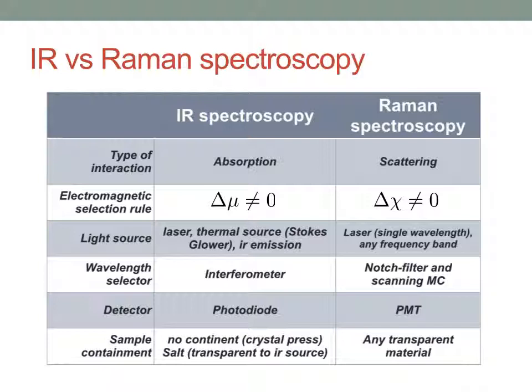And instead of using an interferometer, if I'm not using a laser source, I would have a monochromator, but if I'm using a laser source, I wouldn't. But I need to have some sort of excident monochromator regardless, so I can select the wavelength of the excident light regardless of the incident light wavelength.